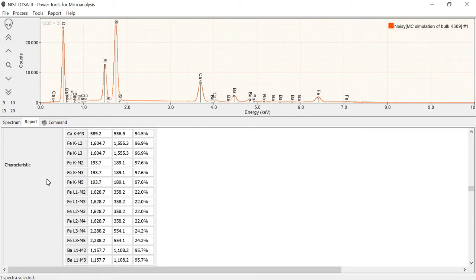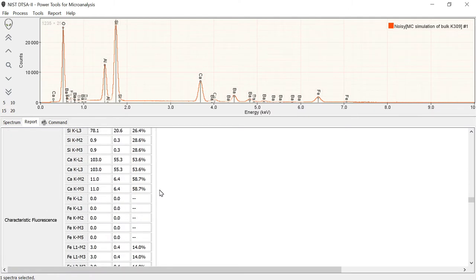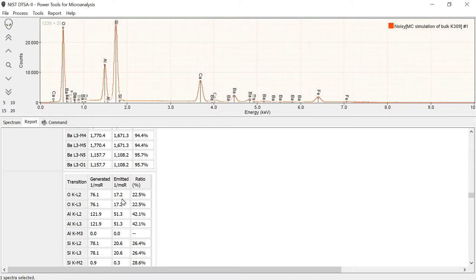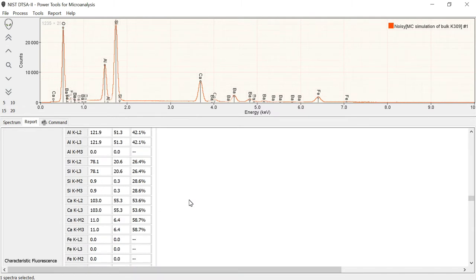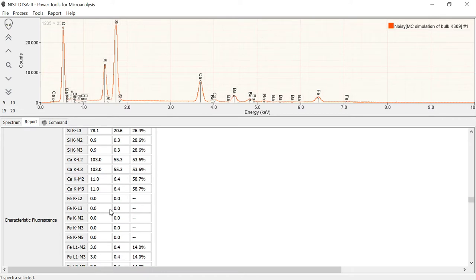We also can model characteristic fluorescence. So this is secondary fluorescence of the characteristic lines. And you can see that you get these numbers generated, emitted, and the ratio gives you what fraction were absorbed. So a lot of information in the table. You can see that for the highest energy lines, the iron-K lines, that there is no characteristic fluorescence because there is no characteristic line up in this region to fluoresce them.